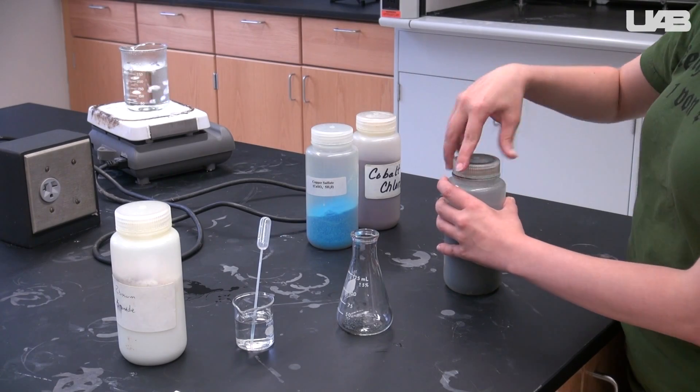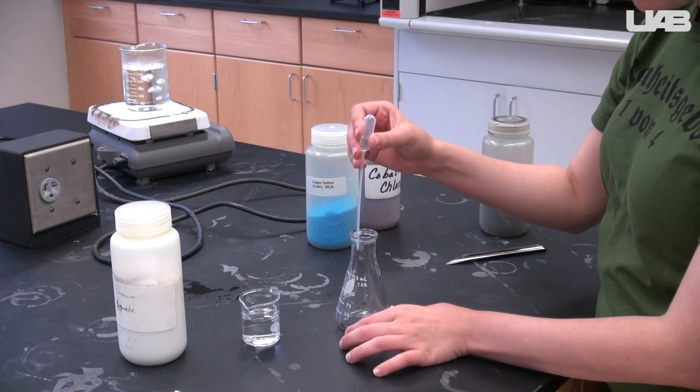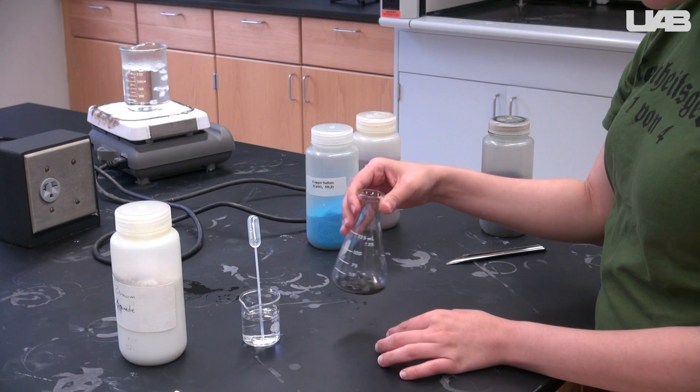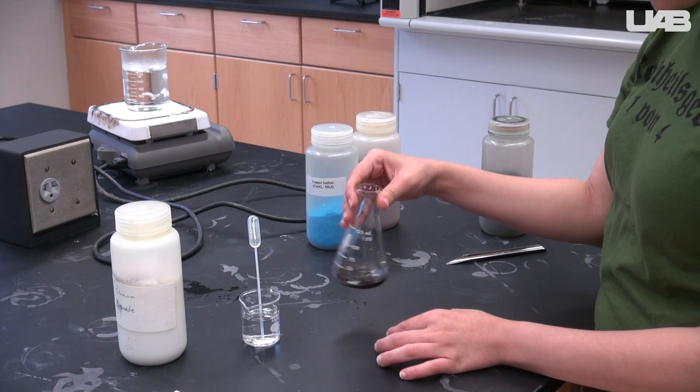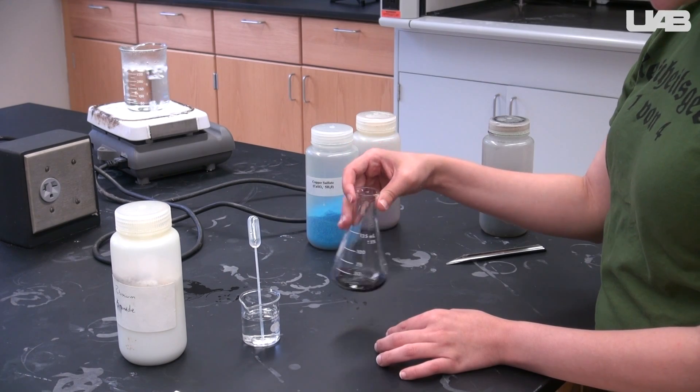First, weigh out about 0.5 grams of copper bromide into an Erlenmeyer flask. Then add 1 milliliter of distilled water. Record your observations in your notebook and compare to your observations from exercise 1 to identify the predominant compound.